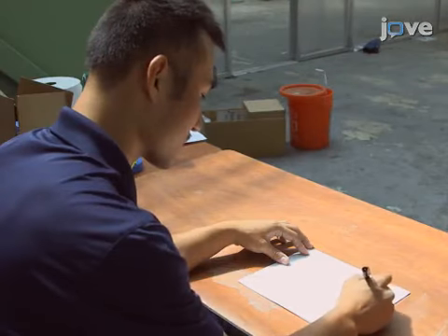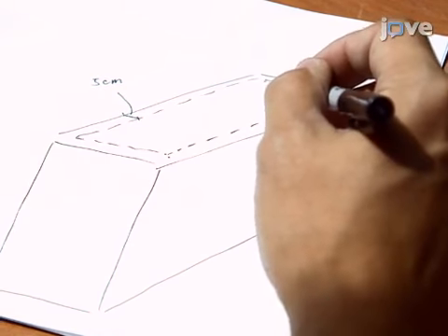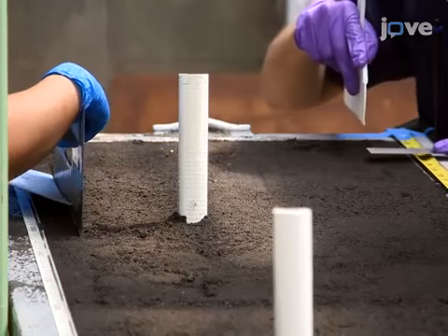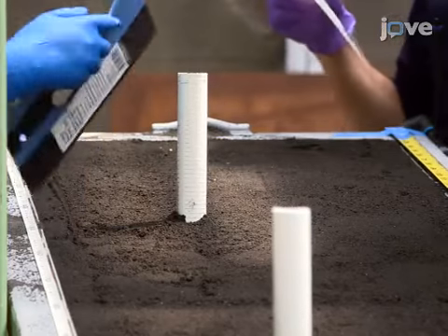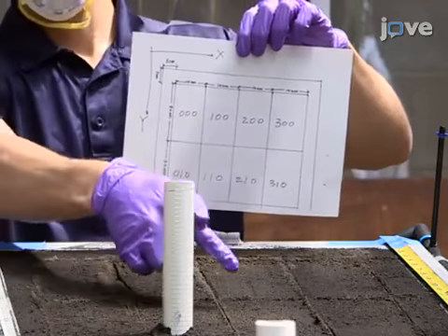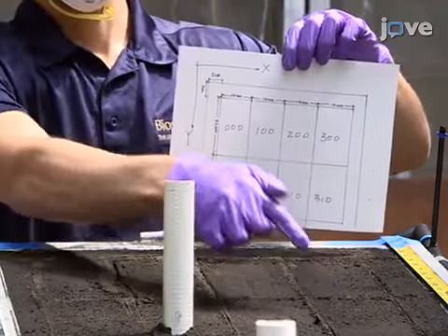Divide the lysimeter into voxels of fixed length, width, and depth using a Euclidean space coordinate system. Divide the total distance along each direction into an adequate number of equally spaced intervals. Assign each sample a unique XYZ location and identify it as a voxel.